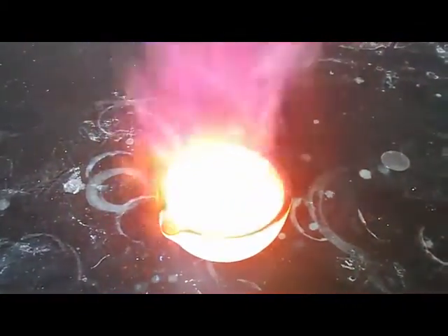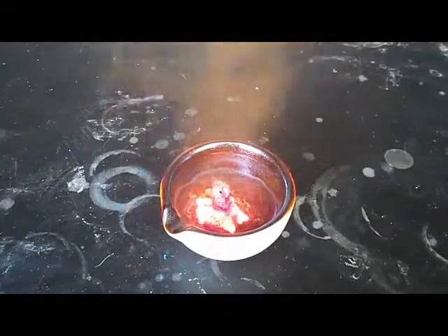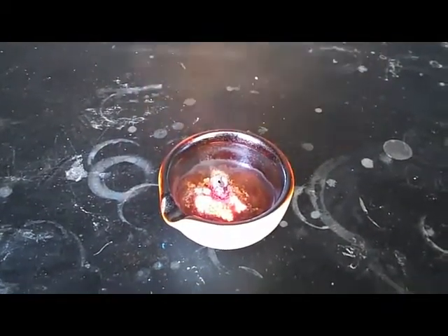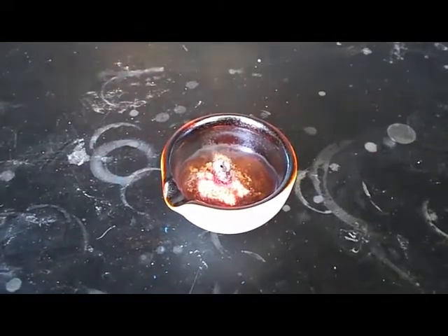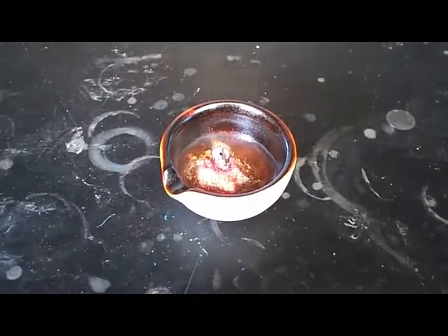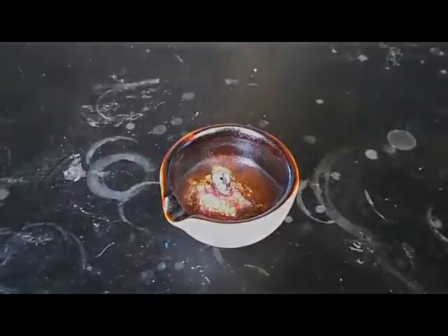We get a lot of purple smoke. It gets very, very bright. And then pretty soon it's over. And what's left behind is something that looks very different from the two substances that I started with. So, very visible reaction. It's fun to watch, and even more fun to do. So good luck. Write your equations.